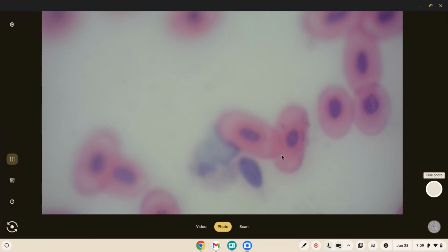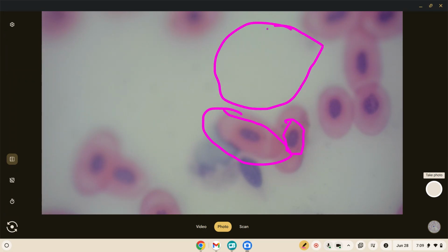Take a look here. As we can see, they have something in the center of them. That wasn't in the human blood, was it? I don't remember that. They seem to be bigger, and one last thing that seems to be different is there are a lot more open spaces than I remember when we were looking at the human blood.